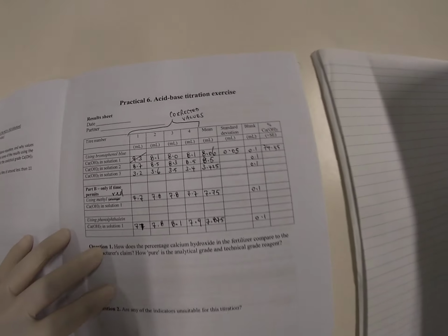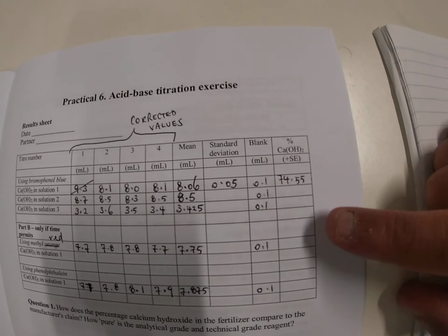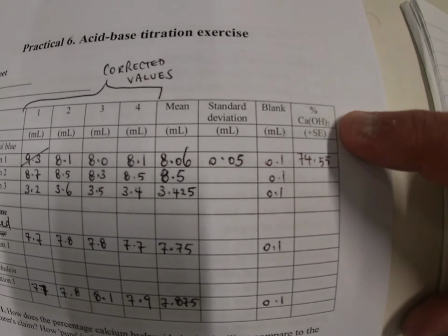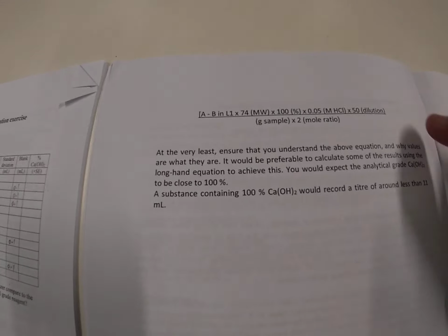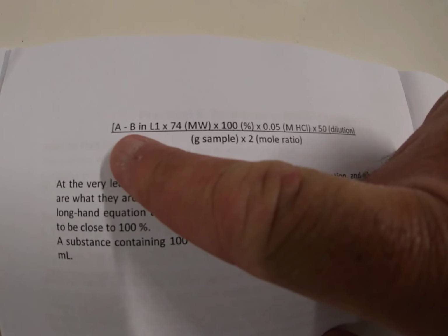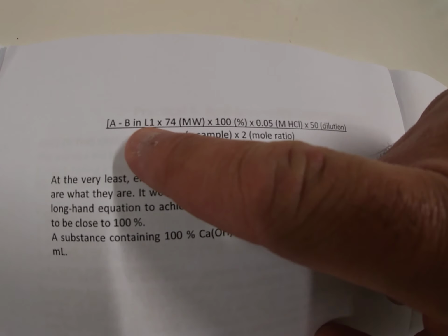Next step. The final part, in order to complete this final table, is to determine the overall percentage of calcium hydroxide. The way we determine that is using this formula, which is on page 48 of your prac manual, which is A minus B. A is the initial titer, minus B, which is your blank, in litres.